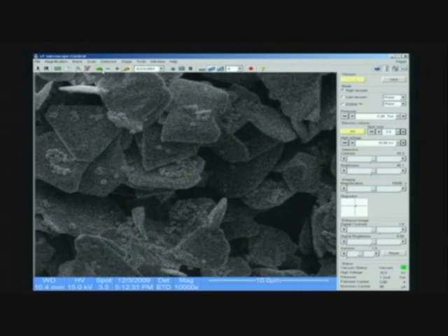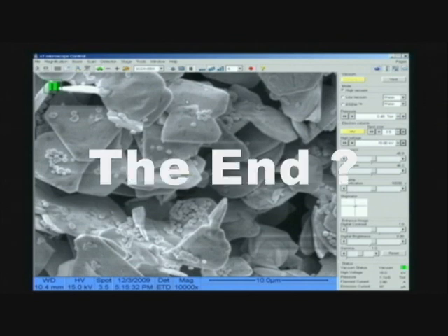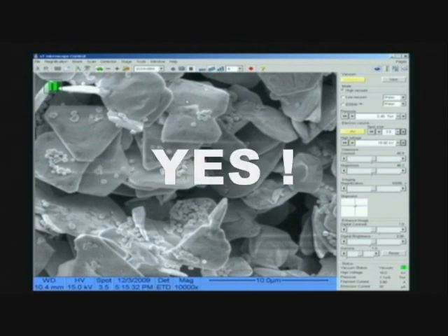Once the image is fully focused and not stretched in either direction, zoom out to your desired magnification. The detailed features of the image should now be in excellent focus and the image of high quality, devoid of stretching in either direction.